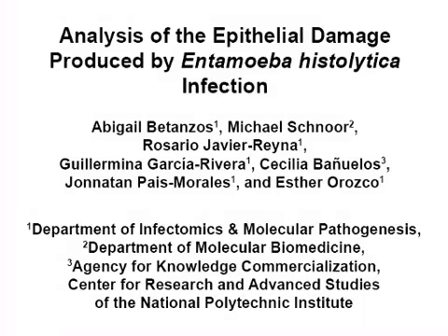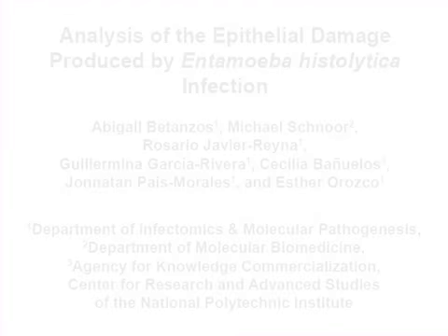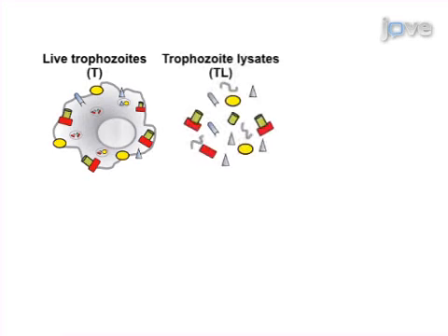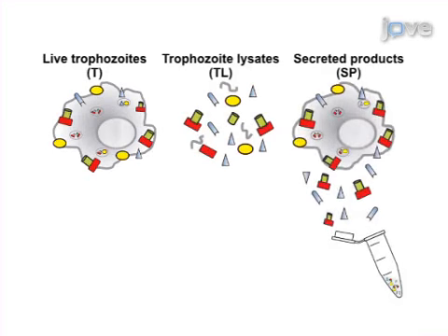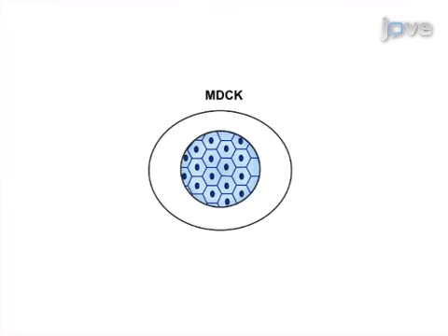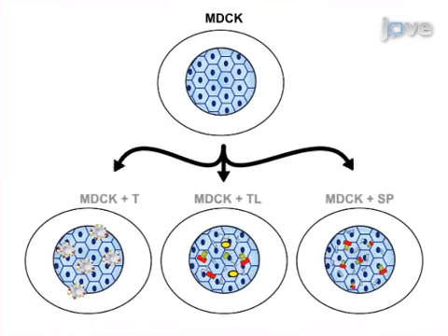The overall goal of this procedure is to assess early host-pathogen interactions and the invasion potential of Entamoeba histolytica. First, make preparations of the intact trophozoites, the trophozoite total lysates, or the secreted trophozoite products. Then incubate host epithelial cells with appropriate concentrations of the different trophozoite products.